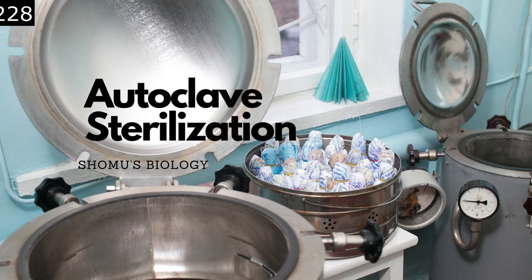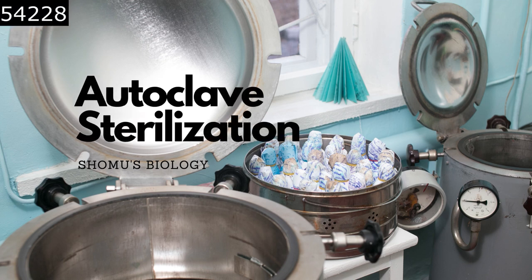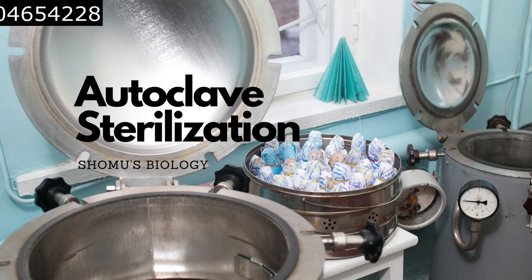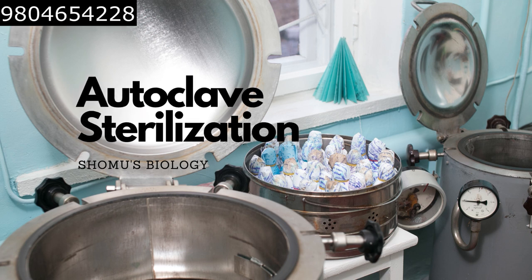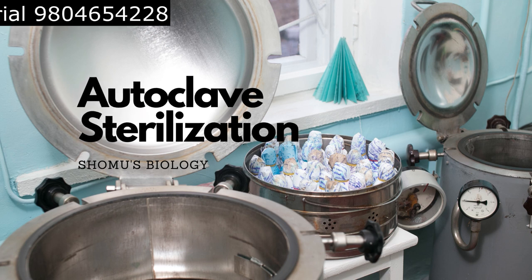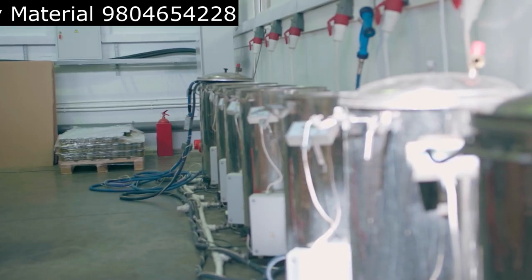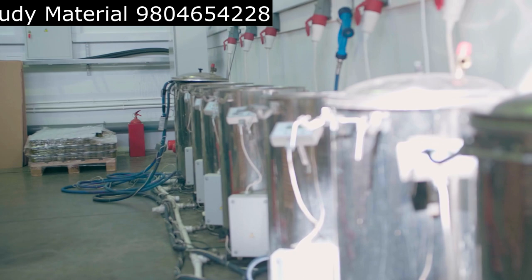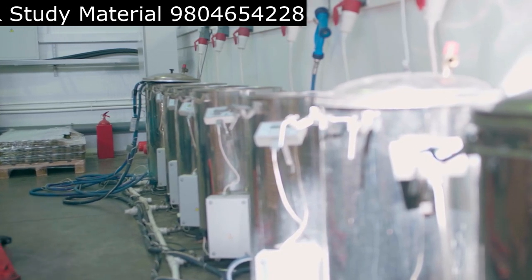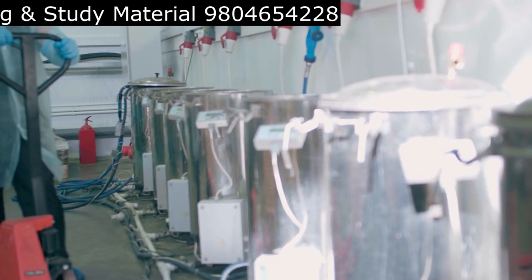Hi there, in this video we are going to talk about autoclave sterilization, a process used to sterilize various medical and laboratory equipment. Autoclaves use steam under high pressure to kill microorganisms, making them a very reliable and effective method of sterilization. In this video we'll be discussing the step-by-step process of autoclave sterilization, so let's begin.